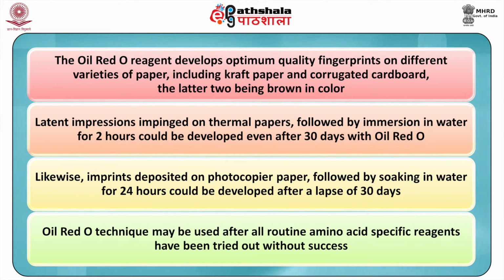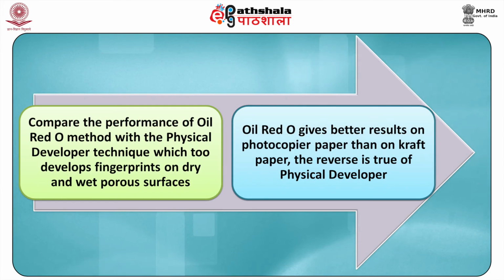Oil red O technique may be used after all routine amino acid specific reagents have been tried out without success. It is pertinent to compare the performance of oil red O method with the physical developer technique, which too develops fingerprints on dry and wet porous surfaces.